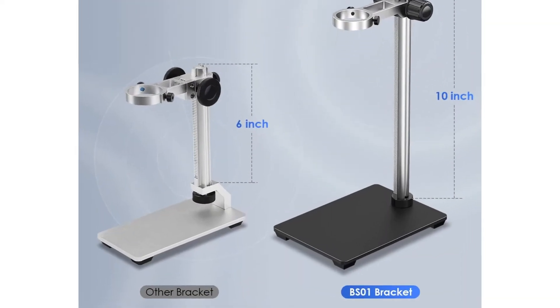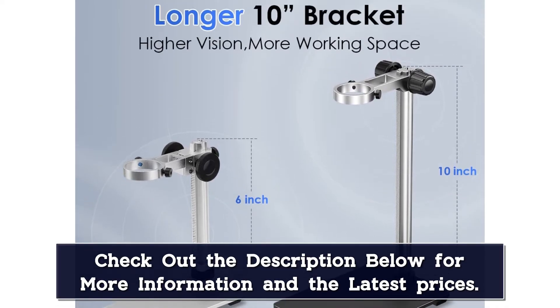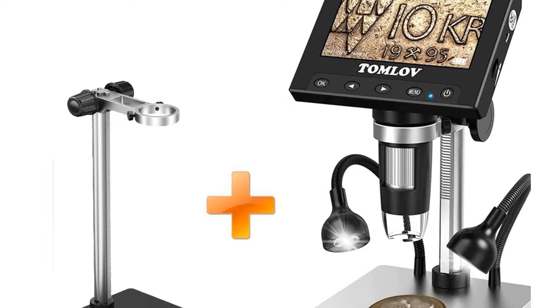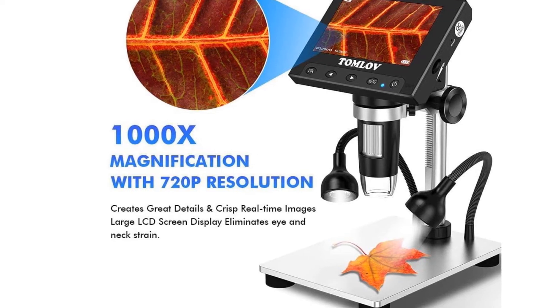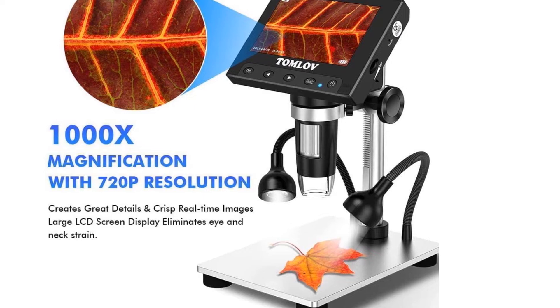This versatile video microscope is easy to use and powerful enough for any teen and adult who shows mild interest in science and engineering. It is also used as an ideal tool providing great details for coin collectors. Utilizing aluminum alloy to build the base, stand, and holder, this LCD microscope offers long-term use and allows micro-soldering or repairing printed circuit boards.